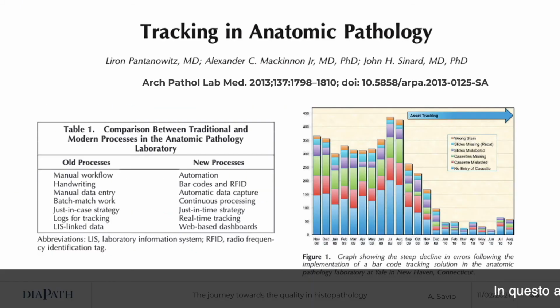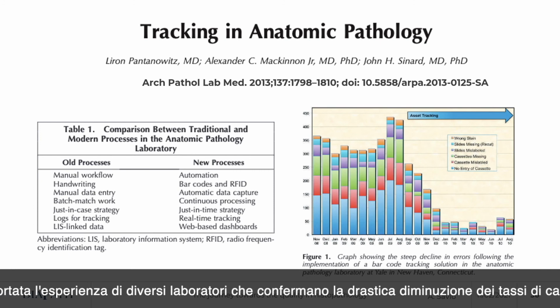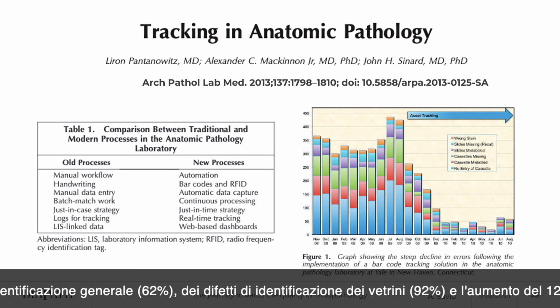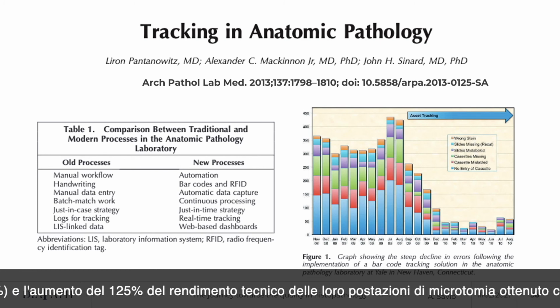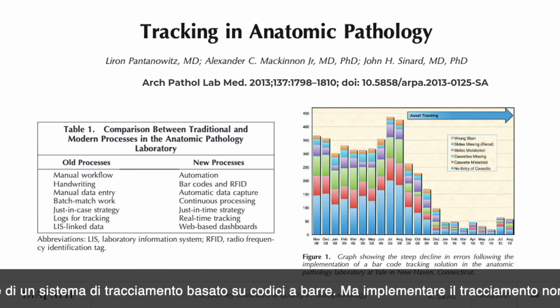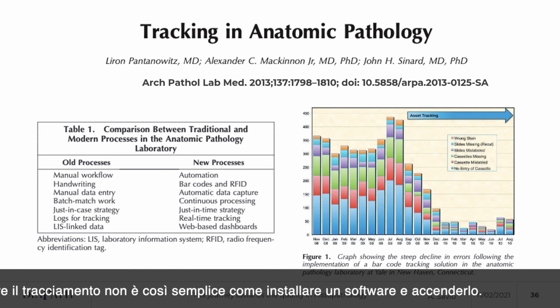In this paper, the experience of several different laboratories is reported, confirming the dramatic decrease in rates of overall misidentification cases, 62%, slide misidentification defects, 92%, and 125% increase in technical throughput at their microtomy workstations obtained by the introduction of a barcode-based tracking system.